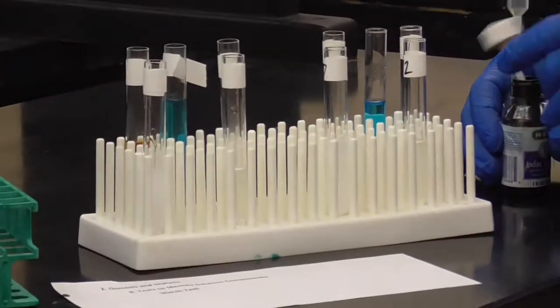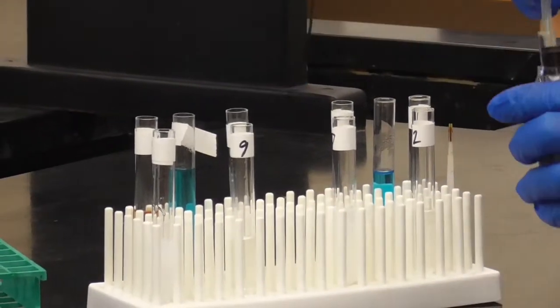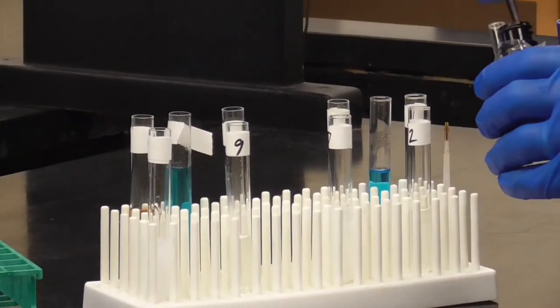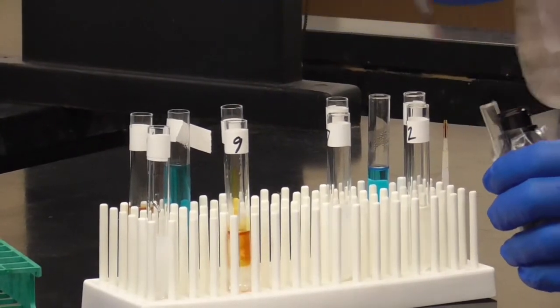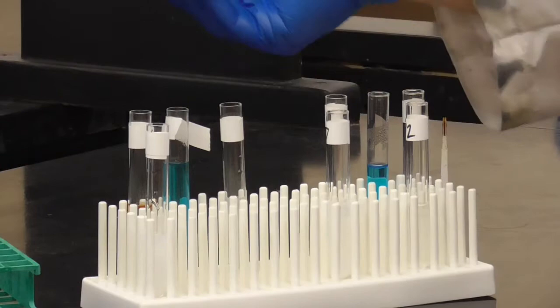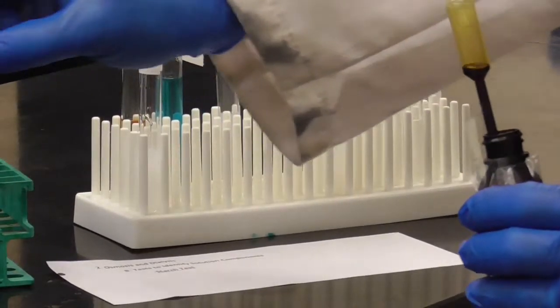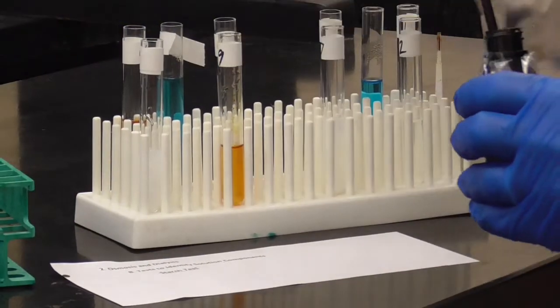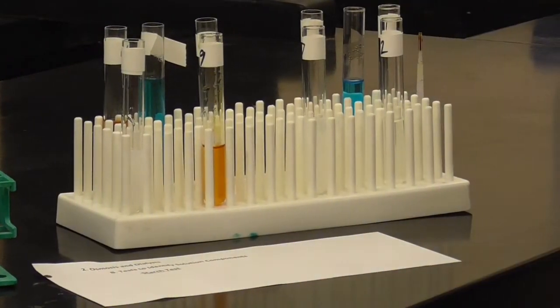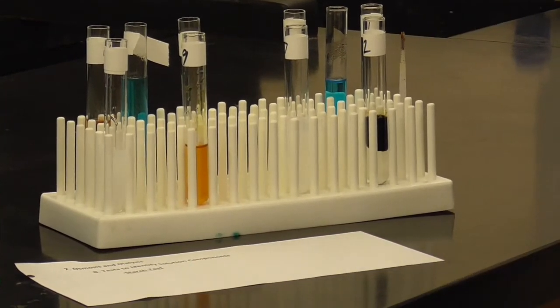Starch test, we just put a couple drops in quickly and easily. So from the outside of the bag, 1, 2, 3, just like that. And remember, here's your negative and there's your positive, and so that's a negative. And from the inside of the bag, 1, 2, 3.